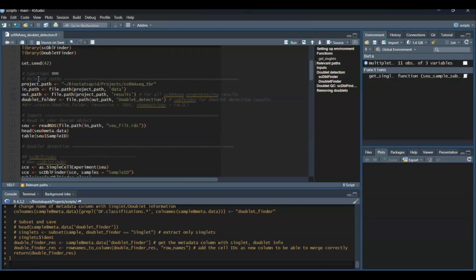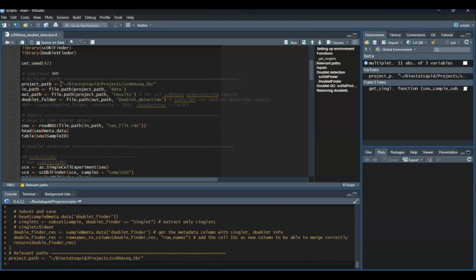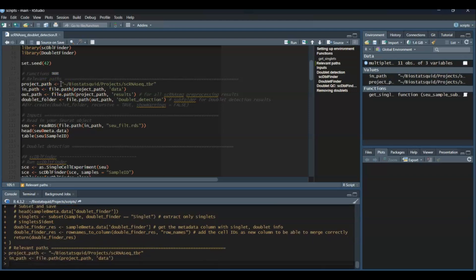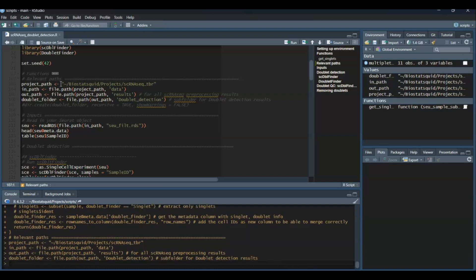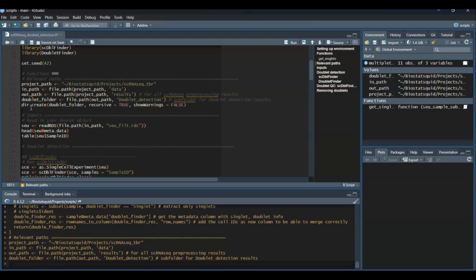Cool, so let's start by setting some relevant paths. I have a project path and inside it I have a folder called data, which will be my input path. I will also create an output path called results, where I will output all my plots and tables from the analysis. I'm going to create an additional subfolder inside called doublet detection. That's where all the doublet analysis results will be saved to. By the way, make sure these folders exist. You can create them manually in your folder system or you can just do it with dir.create if you want to do it from R.